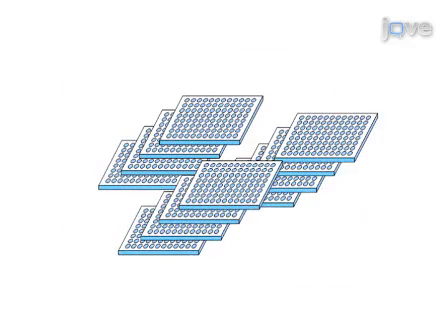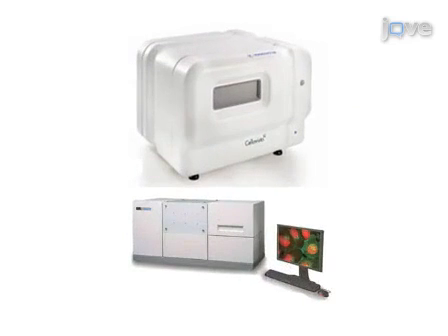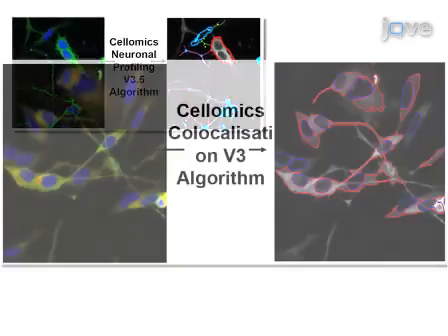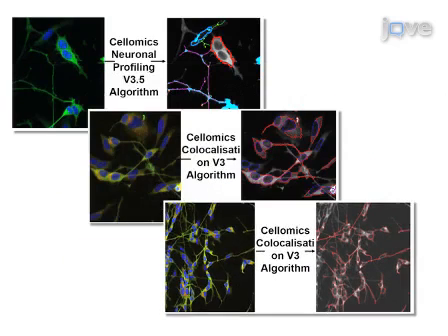Cells are then split, counted, and dispensed into 96-well plates containing lentivirus expressing various shRNAs. After 6 days of cellular differentiation, cells are output from the system for immunostaining and high-content imaging. Finally, the images are analyzed using a variety of analysis algorithms to quantify features related to cell health, neuronal outgrowth, and mitochondrial function. Results are also analyzed by two-way ANOVAs to identify significant interaction effects.